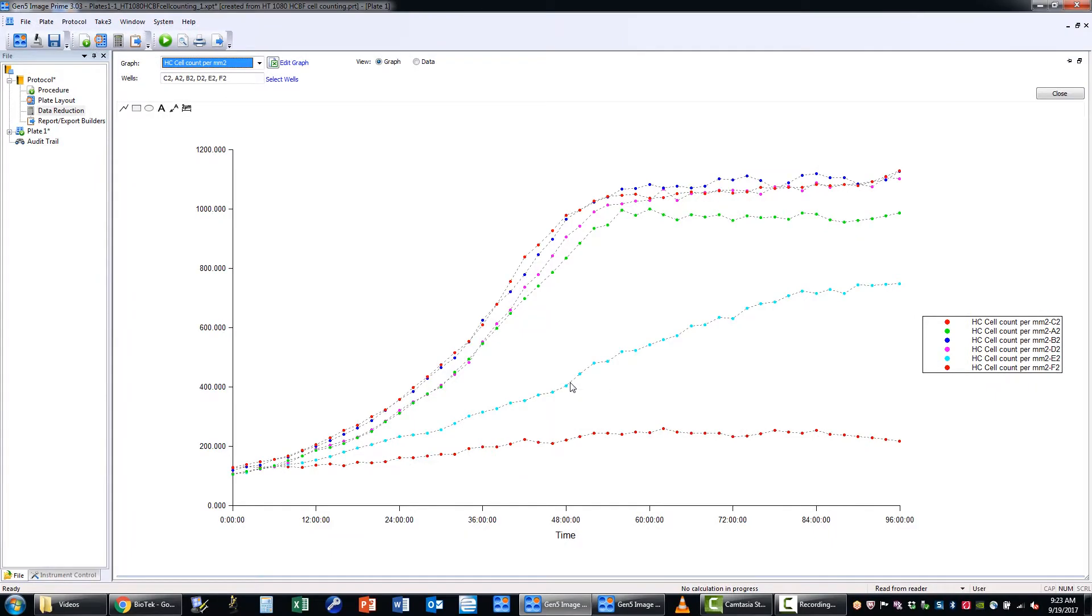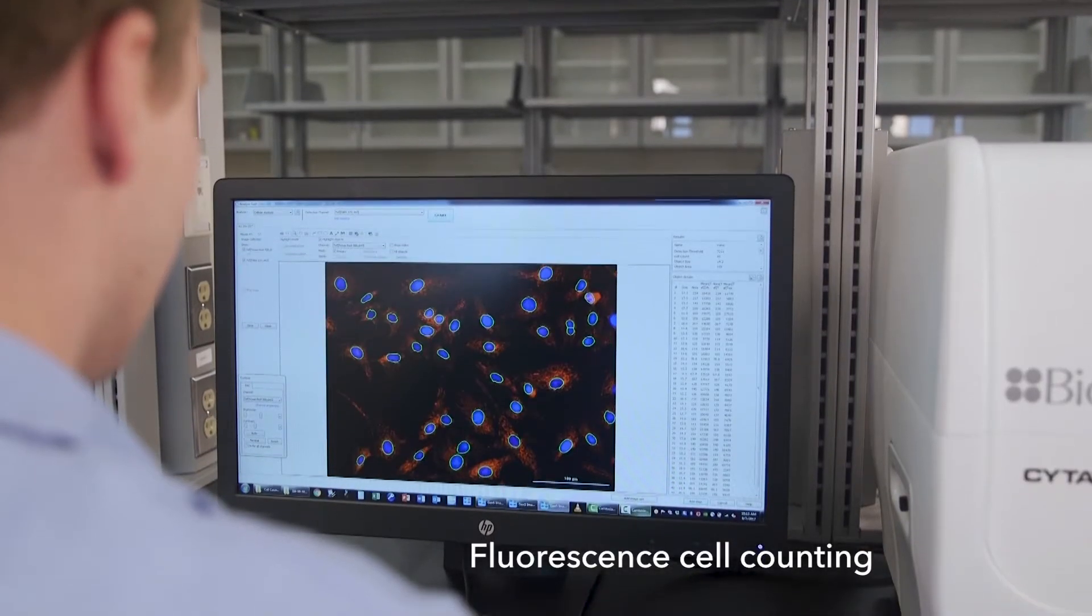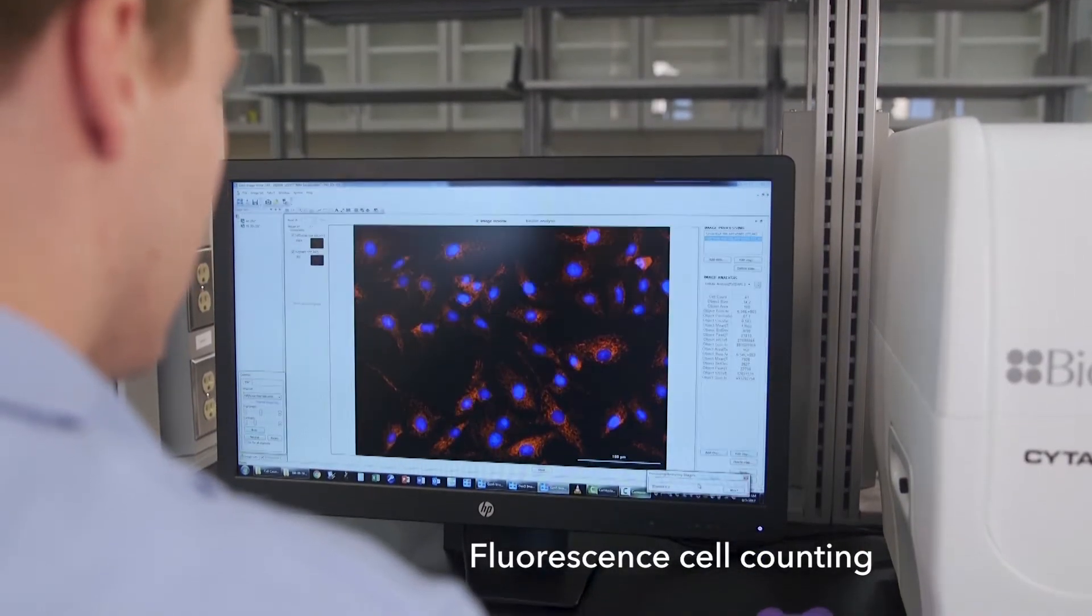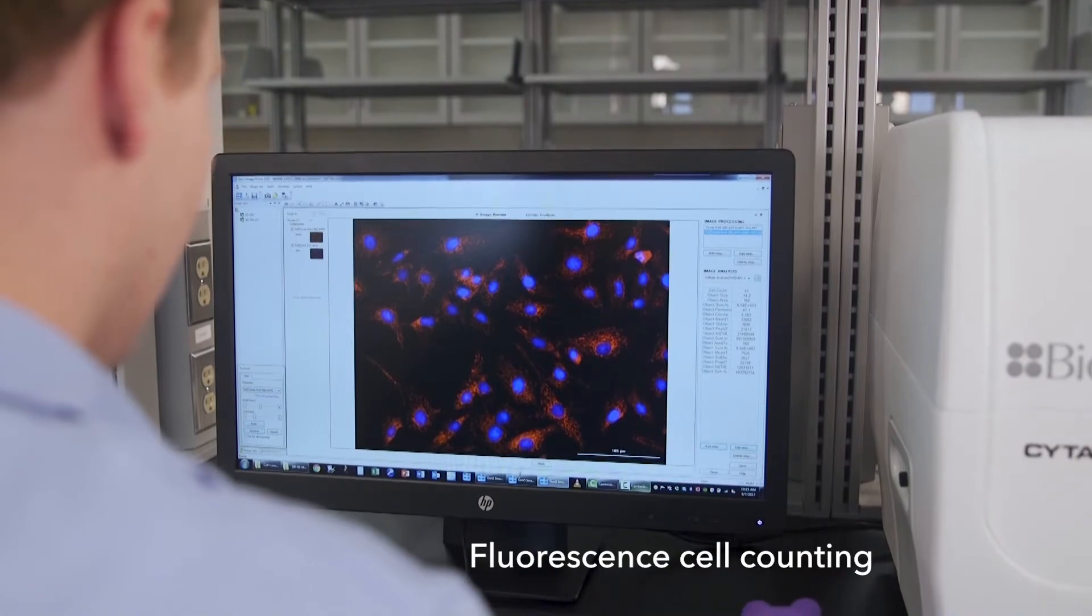Citation One can easily count fluorescently stained cells in microplates and other labware.